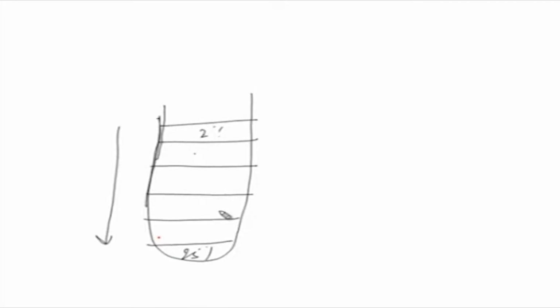You can use a gradient maker to make a continuous gradient, where the lowest part at the bottom of the tube contains the highest gradient material, and the upper part or the start of the tube has a lighter or lower concentration. The sample, of a particular material or particular components, which could be macromolecules or subcellular organelles, will be placed here, and then centrifugation is performed.